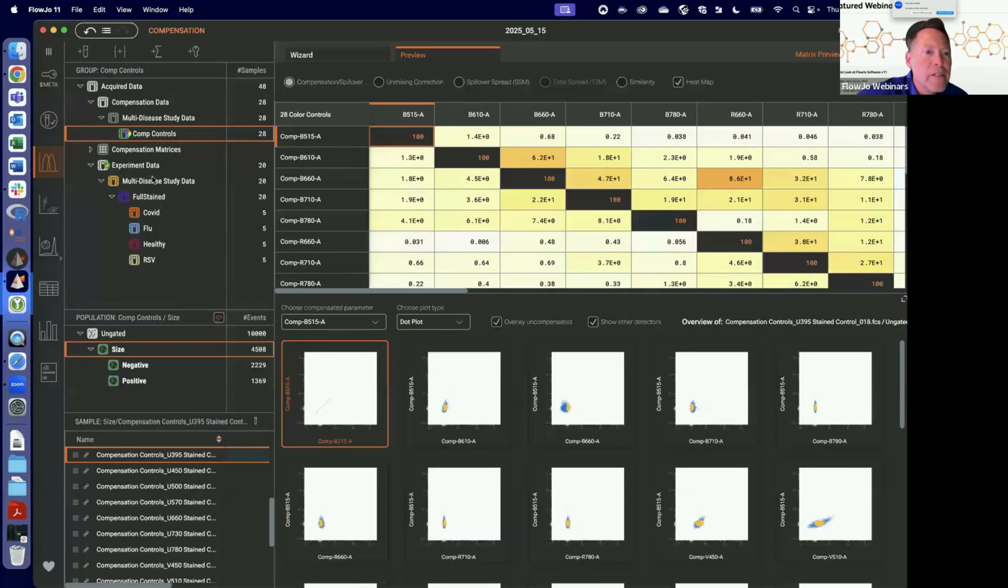Okay, 2 new messages. All right, discussion on QC. Yes, you can have multiple unstained controls. I assume that question came in before I pointed out you can tag each unstained control. Autofluorescence extraction works actually the exact same as in previous versions of FlowJo, where if you're using autospill, we had that U450 in there, which was actually unstained, and we're just going to use that and make a parameter. It's going to use linear regression to figure out any deviation from a flat line is probably due to autofluorescence, and then you get an autofluorescence parameter or an extraction parameter.